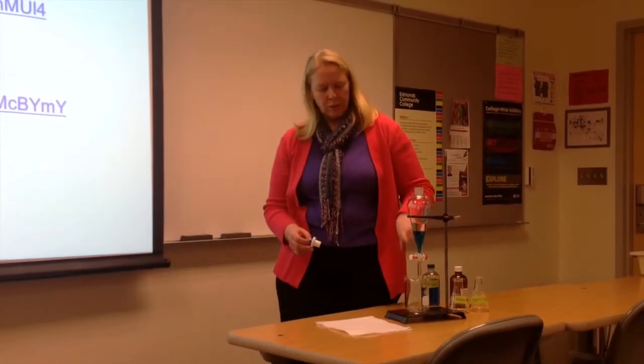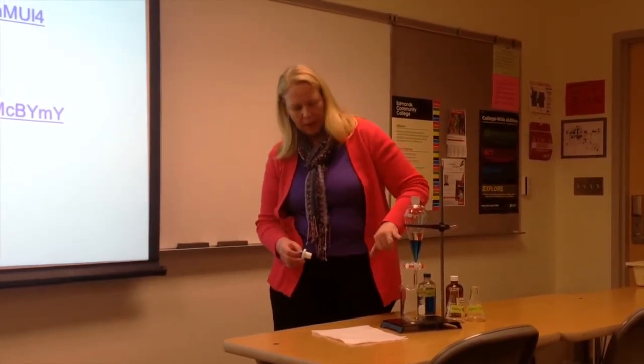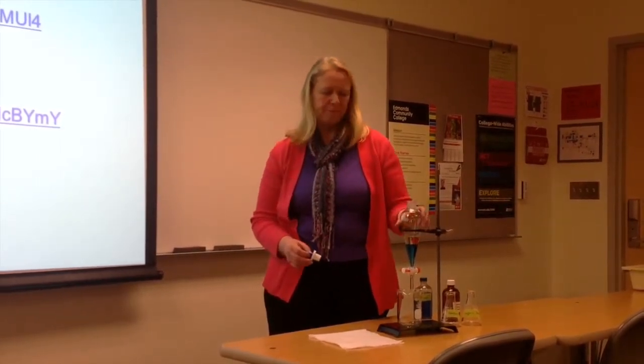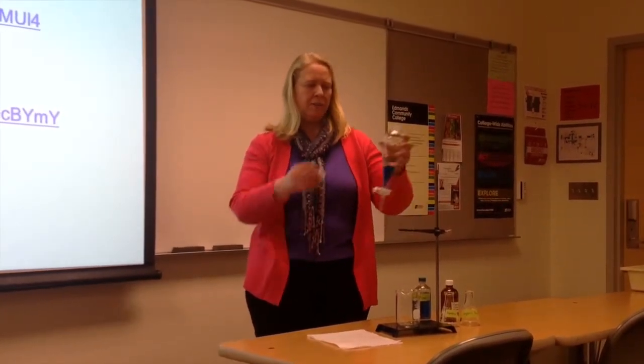So once you have your 2 layers in there, I would not call them upper or lower layer. I would call them, this is our ether layer, this is the organic layer, the bottom is our aqueous layer. So always make sure you keep track of those and where your compound is.